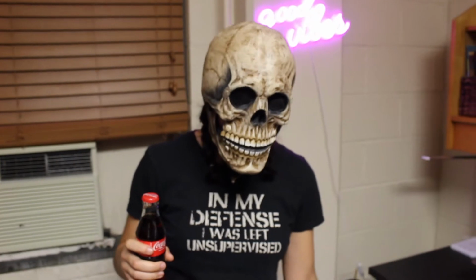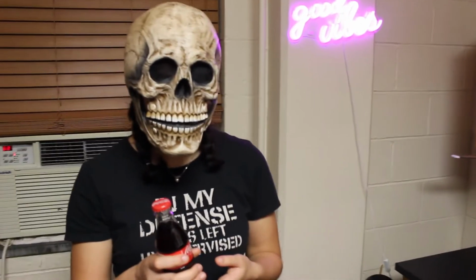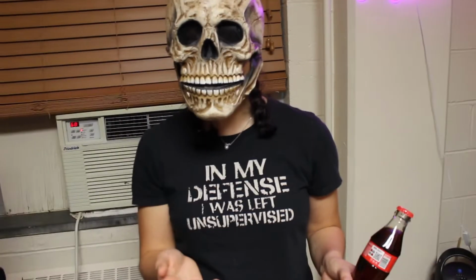Nice. So, from what I've heard from your tips and tricks, I really do know how to use a spectroscope better, but from what I hear and have gathered, it isn't that dangerous, right? Carly, very true. A spectroscope isn't dangerous, but just make sure not to look directly at the sun, because you could potentially damage your eyes, and we wouldn't want that.